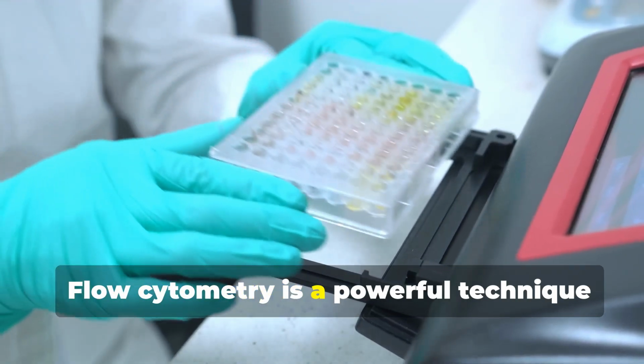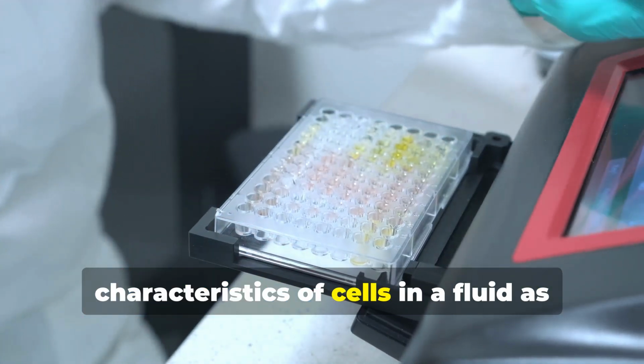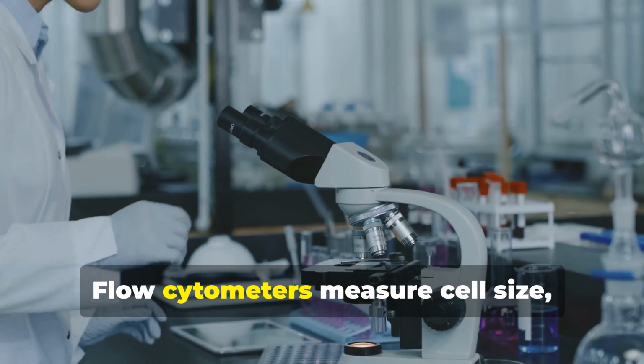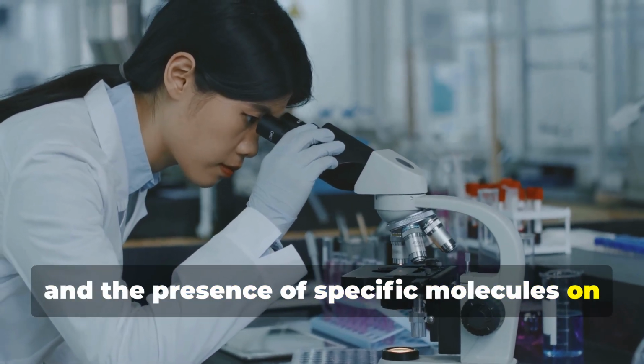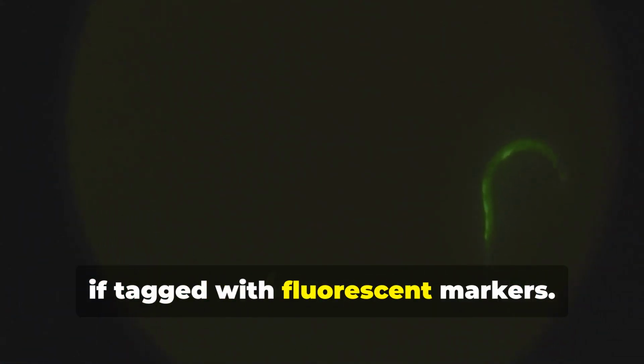Flow cytometry is a powerful technique used to analyze the physical and chemical characteristics of cells in a fluid as they pass through a laser beam. Flow cytometers measure cell size, complexity, and the presence of specific molecules on the cell surface. As cells pass through the laser, they scatter light and emit fluorescence if tagged with fluorescent markers.